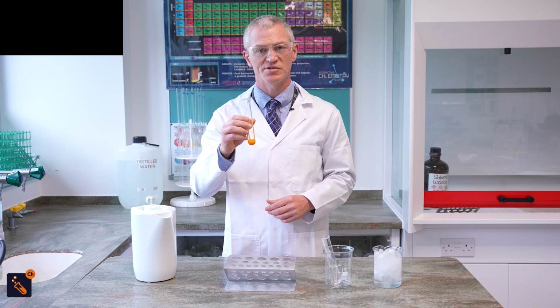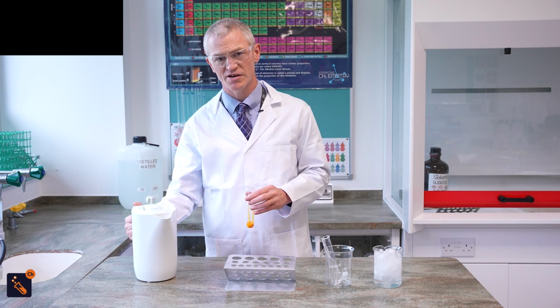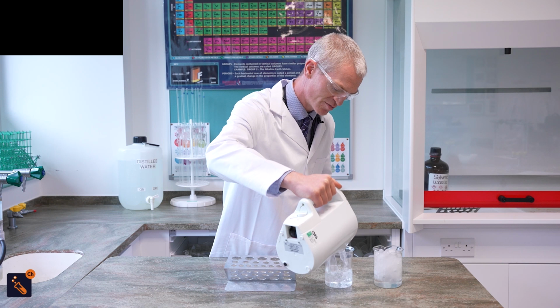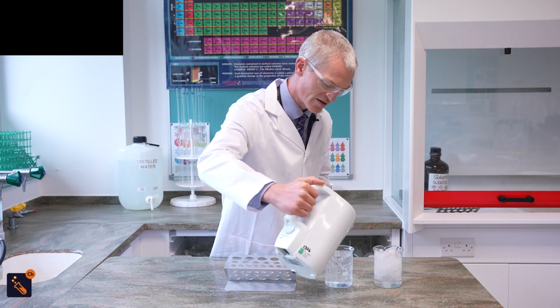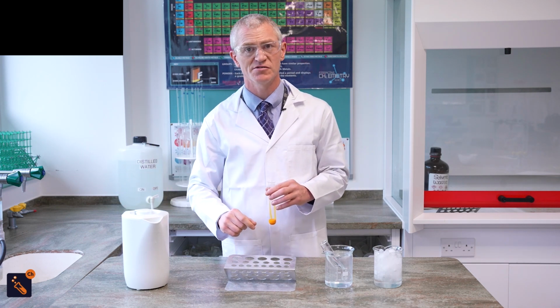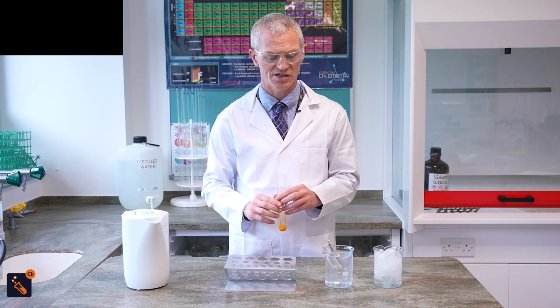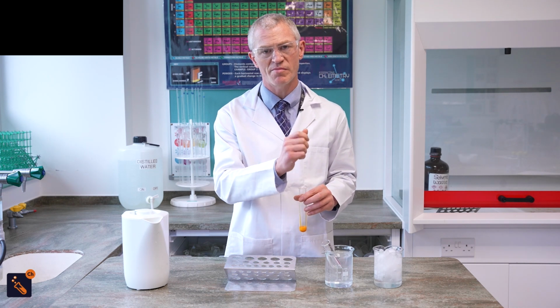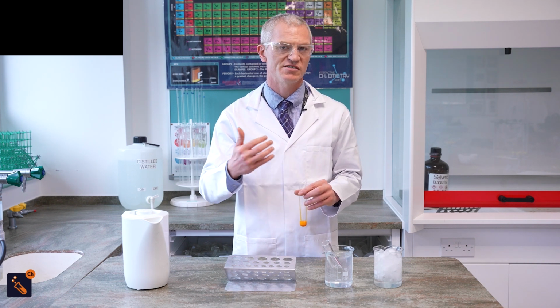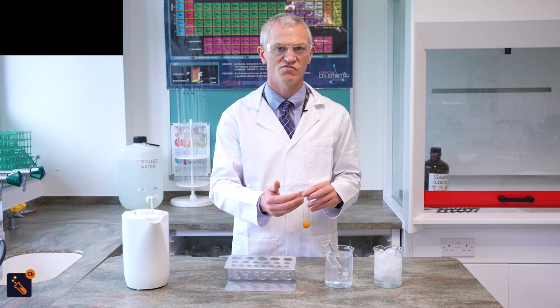We're going to take this precipitate and dissolve it in a minimum amount of hot solvent. We have a recently boiled kettle right here, and we have our solvent in the boiling tube. You've got to make sure that it's very, very hot, so make sure that it is a recently boiled kettle, and that you have enough solvent to do the recrystallization. Normally you would add a minimum amount of hot solvent to make sure that your product crystallizes out at the end. That minimum amount of hot solvent is really important.